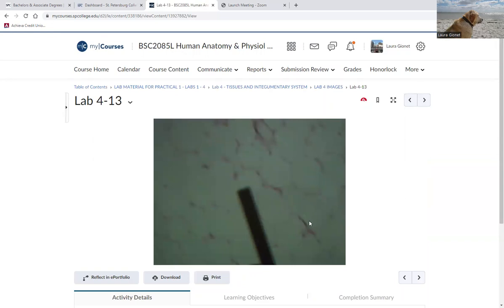Okay, this is another standalone slide, you might call it. Mostly what you're going to see here is adipose connective tissue. It's a very good specimen of fat tissue by itself, but sometimes you'll see some little blood vessels in here. It has a honeycomb or chicken wire appearance, with large cells with a big fat vacuole in them. Like 90% of the volume of the cell is fat in a vacuole or kind of a vesicle.